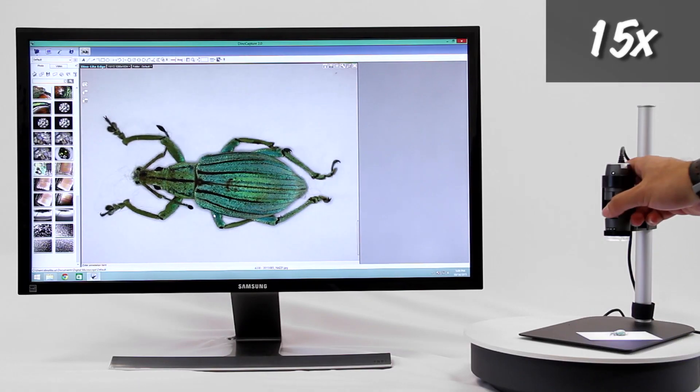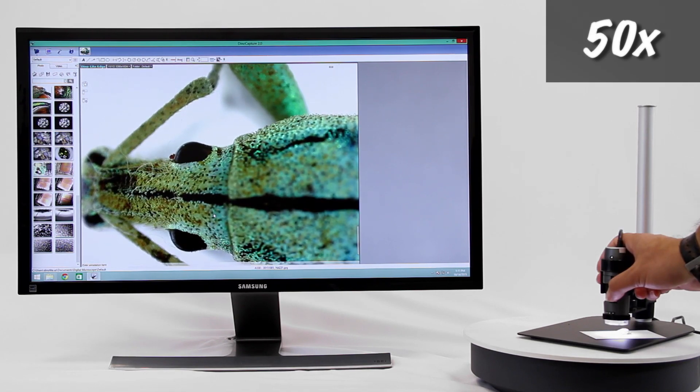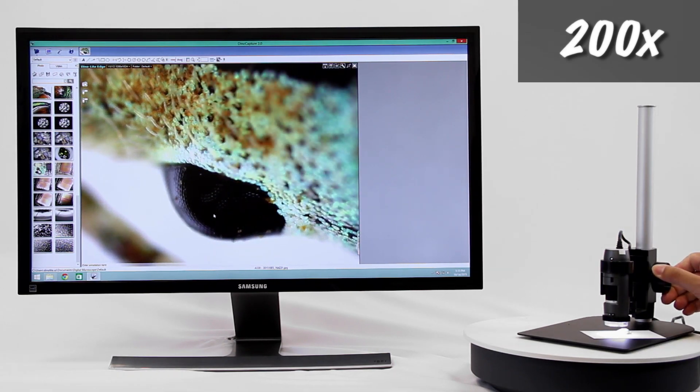This is an example of the standard working distance and corresponding magnifications. Using a Dynolite stand is recommended to help aid in the best viewing experience and image capture.